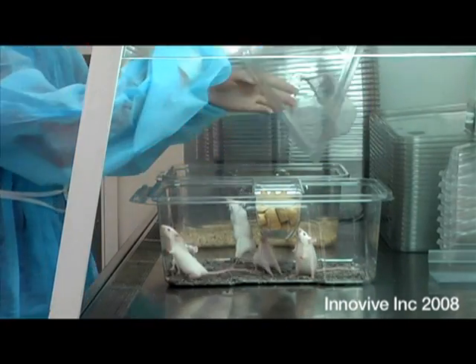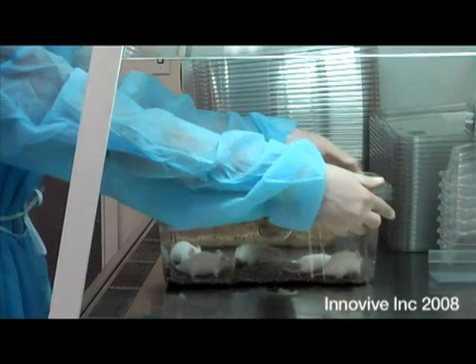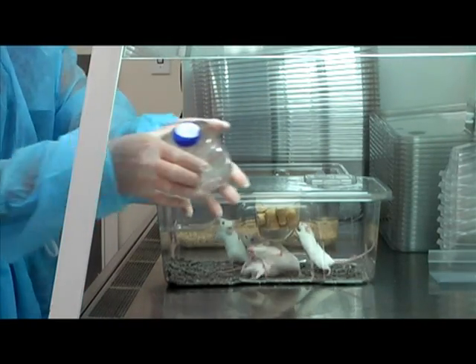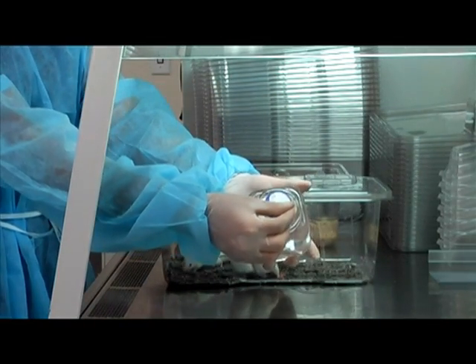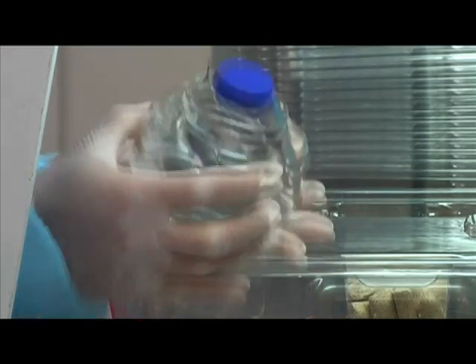Place the lid on the inner cage and secure it gently by pressing down on the corners. Our pre-filled water bottles are very convenient — just peel the label from the cap and place the water bottles in the lid.